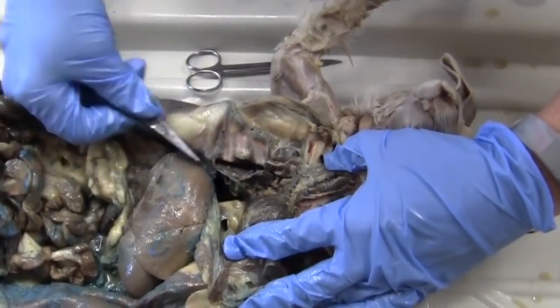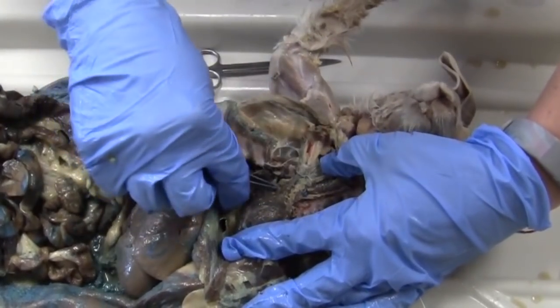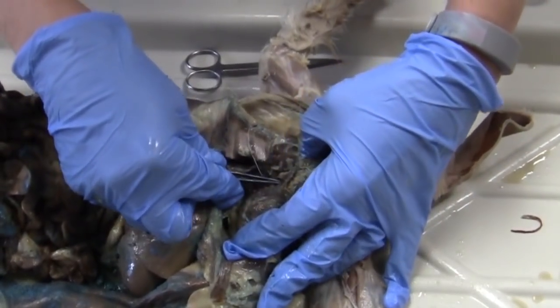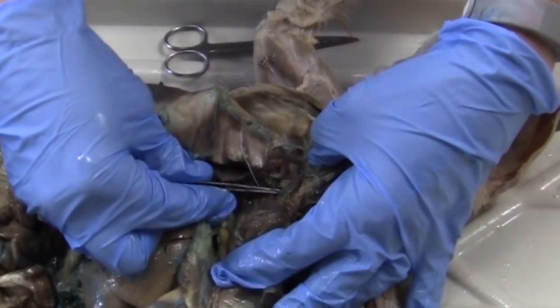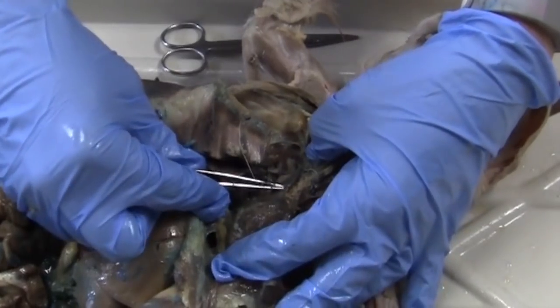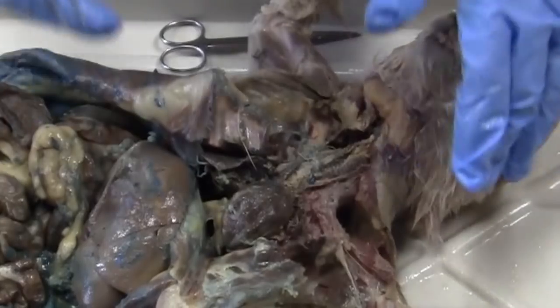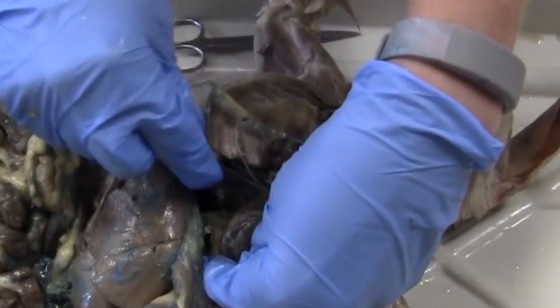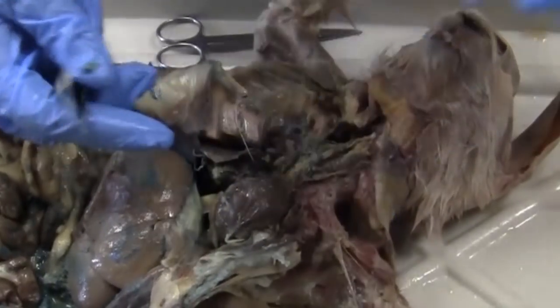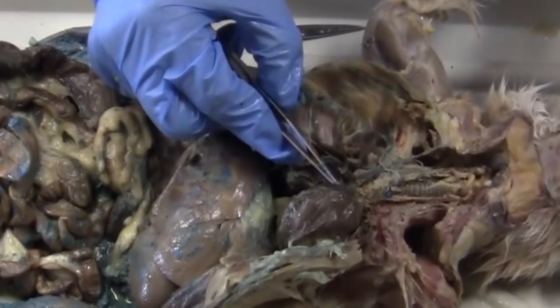So we're coming into the cranial vena cava. We also have another vein called the azygos, and that is the first branch off of this cranial vena cava. So it actually wraps around the back of the heart, and I'm going to show you that when we cut out the heart. So it actually lays kind of on that bottom side of the heart, on the dorsal side of the heart.